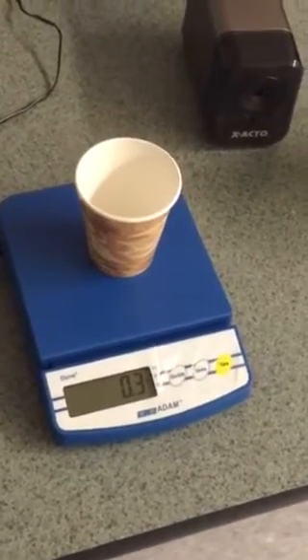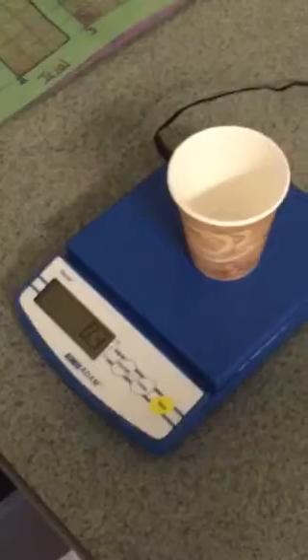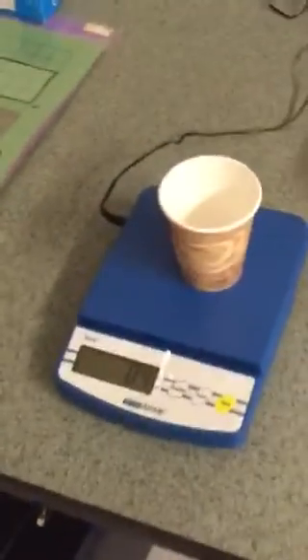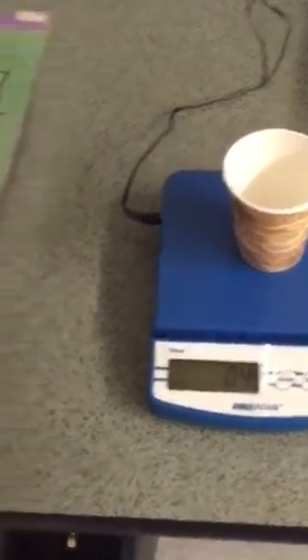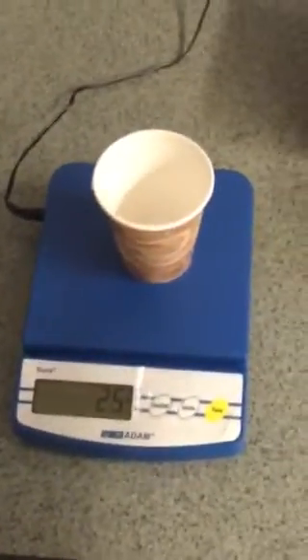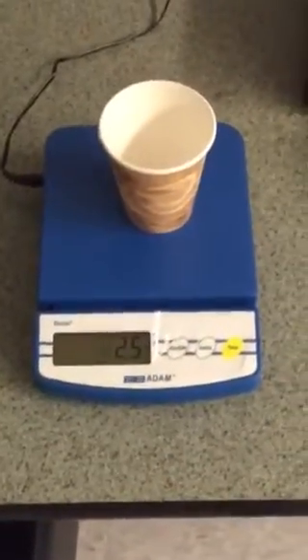So what we do now is take the object that we want to measure. In this case we're looking for about one and a half to two grams of salt, and gently start filling it up. We now have about 2.5 grams of salt.